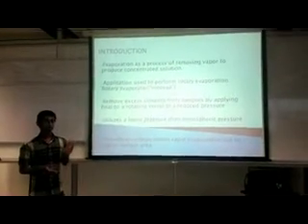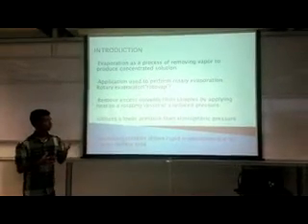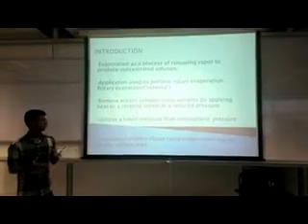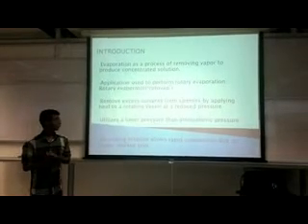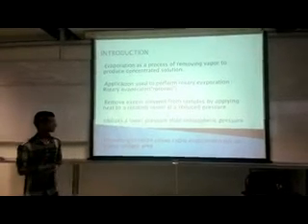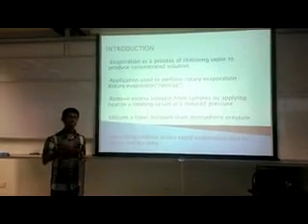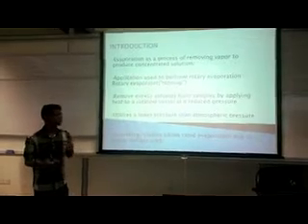The function of this rotary evaporator is to remove excess solvents from samples by applying heat to a rotating vessel and reducing pressure. It also operates at a pressure lower than atmospheric pressure. In other words, there are many features added into this system. One is that it increases rotation. By increasing rotation, it also increases the surface area, which allows rapid evaporation due to the higher surface area.